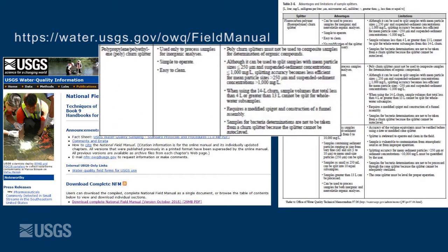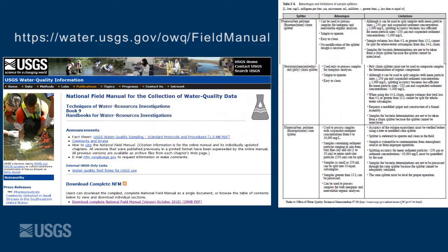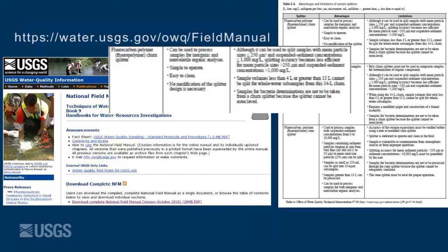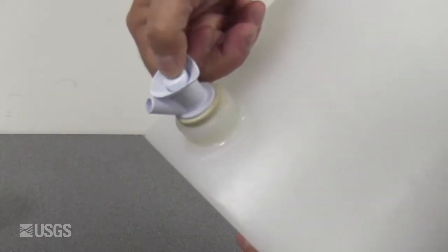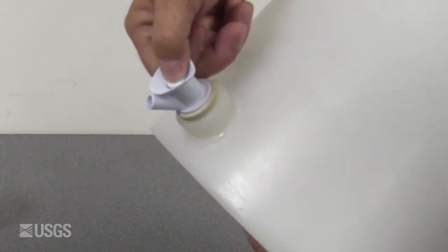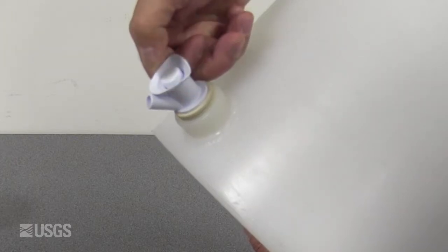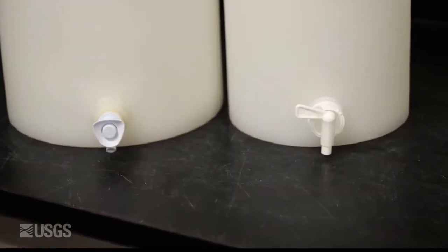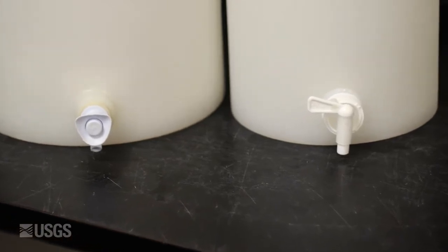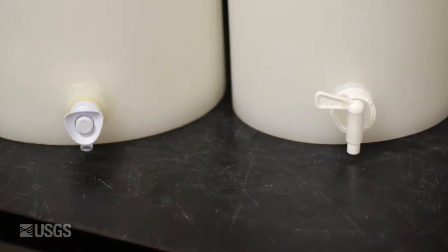The plastic churn should be used to process samples for inorganic analyses. The polymer churn can be used for either inorganic or non-volatile organic analyses. The original spigot on the plastic churn contains a metal spring that was found to be a source of metal contamination and must be replaced if the churn is to be used to process samples for trace element analysis. The spigot can be replaced by the manufacturer with non-contaminating components.